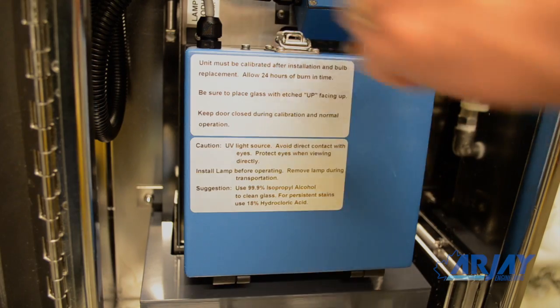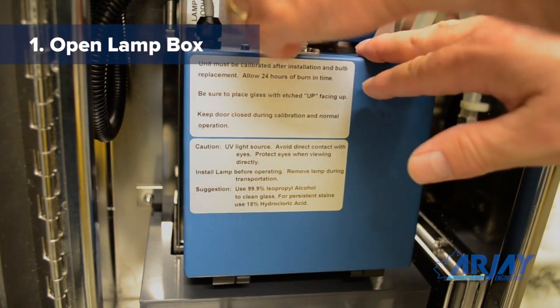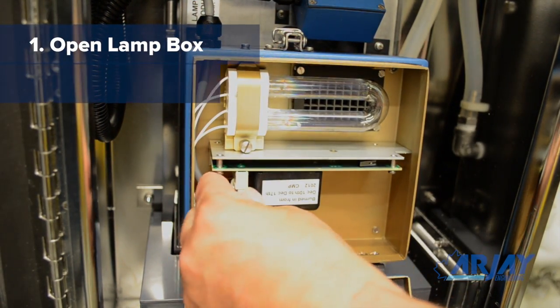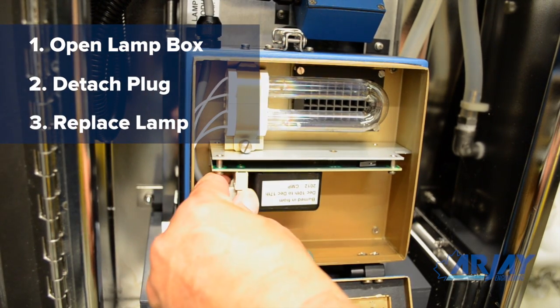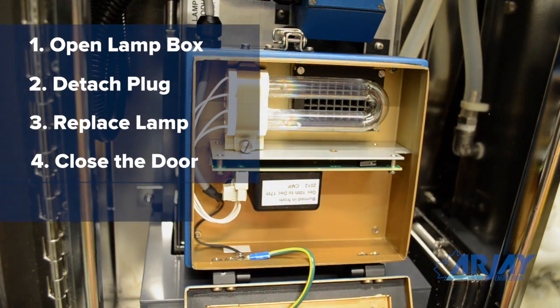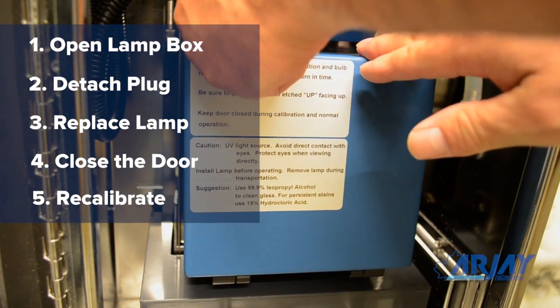This will be prior to its actual failure to give you time to schedule a lamp replacement. To replace the lamp, open the lamp box door. The lamp has a plug-in terminal for easy replacement. Install the new lamp, close the door, and perform a recalibration. Lamps will typically last two to three years.